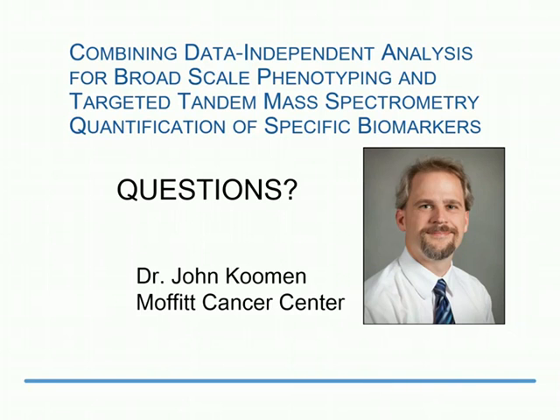All right. Next question is, about how many micrograms do you inject per sample? That's a very good question. We expect from the whole tissue section that we had maybe 25 micrograms total protein, so we're probably injecting between 250 and 400 nanograms for each sample that we put in. One of the things that we're still trying to understand, especially for the smaller samples, is trying to determine a good way to measure the digestion efficiency there and see the total recovery at the peptide level, rather than trying to do protein assay from a larger sample and then carry that estimate through to the end.